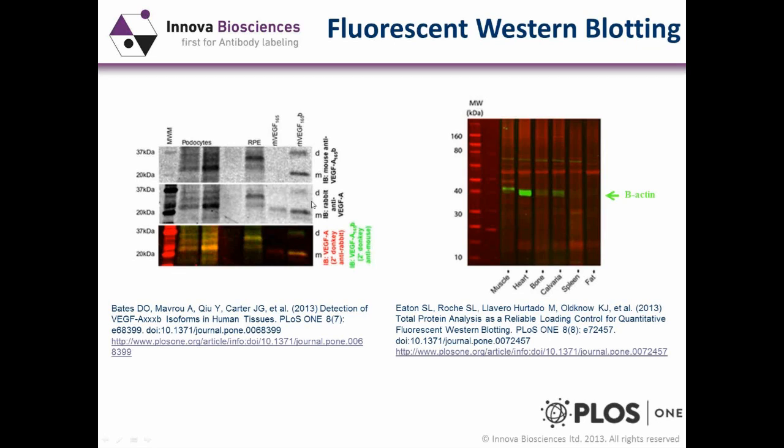They were able to take these 2 images and overlay them to create a pseudo image, in which one antibody is shown in red and the other in green. As you can quite nicely see, this band here contains a mixture of both proteins migrating at the same size.